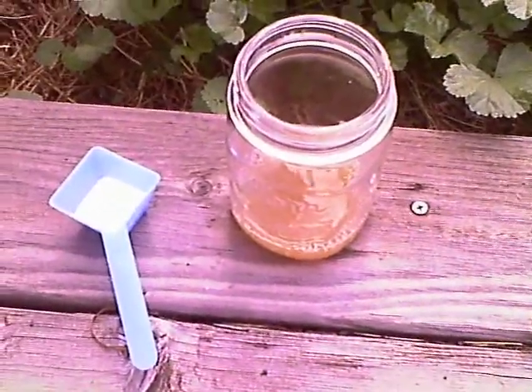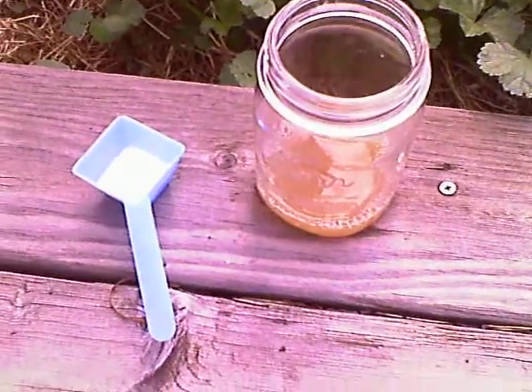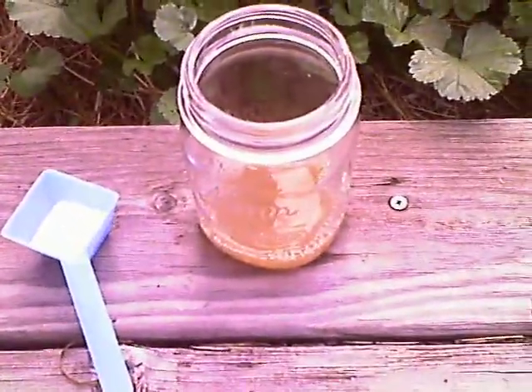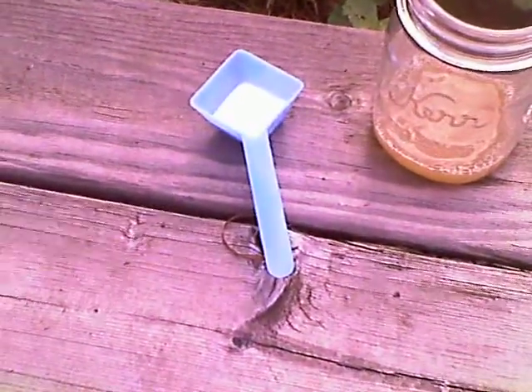Hello, welcome to 42 Super Nerds. Today, we'll be reacting the porphine we made earlier with oxyclean.